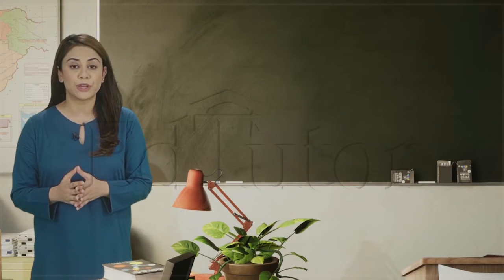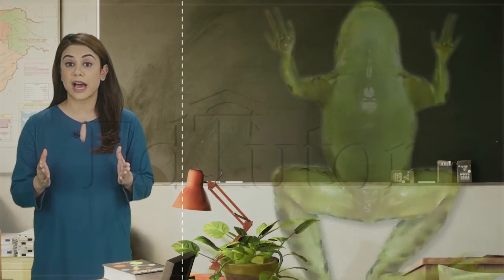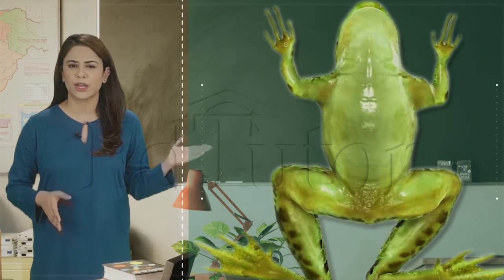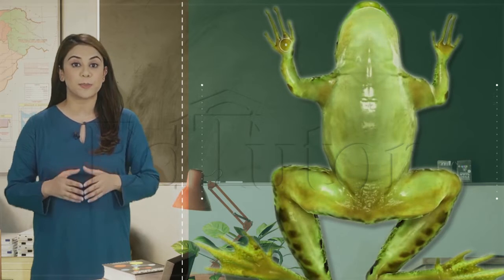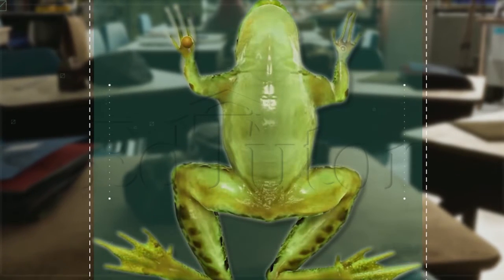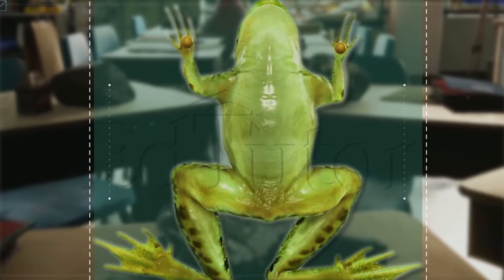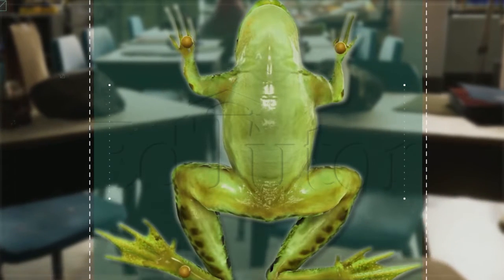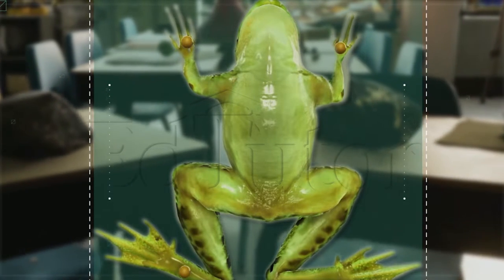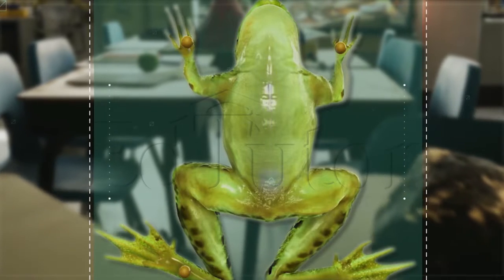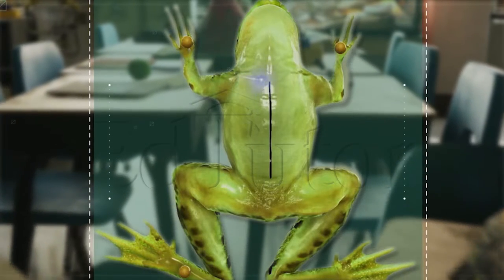I am going to take the unconscious frog, gently turn it on its back and pin it to the tray. From the ventral or the front side, I am going to lift its skin up and cut it along the center, from the cloaca all the way to the lips.